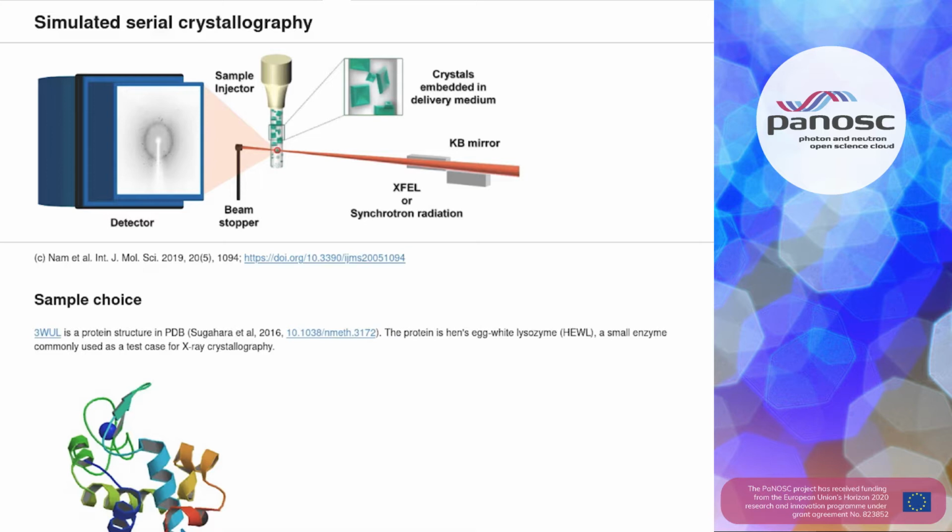In many of the thousands and thousands of images, the beam won't even hit a crystal, and when it does, that crystal could be at any angle. There could even be more than one. So processing the data requires both computational power and specialised code.